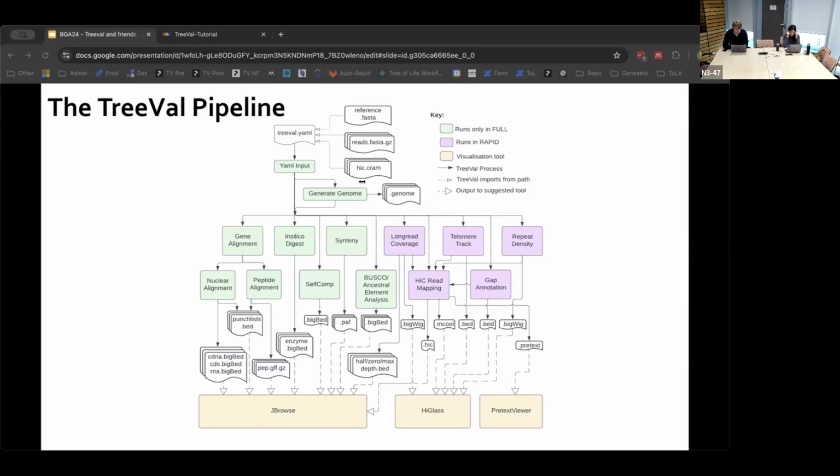These sub-workflows replicate the functionality of GVal. The only additional new one from GVal is the ancestral element analysis sub-workflow, which was originally developed by Charlotte Wright from the Blaxter Group and added into our pipeline. It allows for the mapping of putative ancestral chromosomal units using BUSCO genes. Currently, this is only available for Merian units for Lepidoptera, though we are looking to expand this to other clades. The details of this are found in the project.